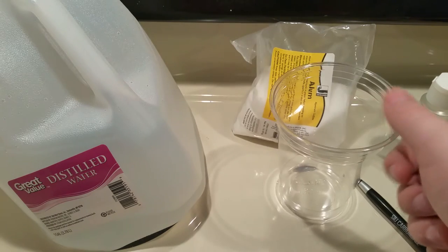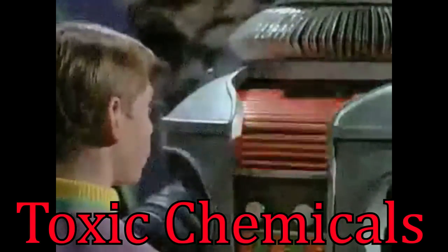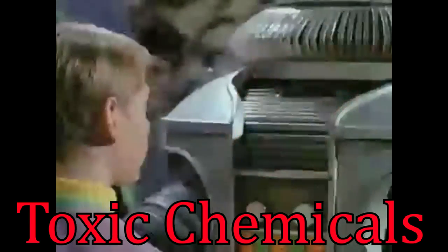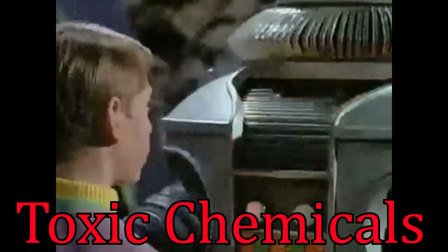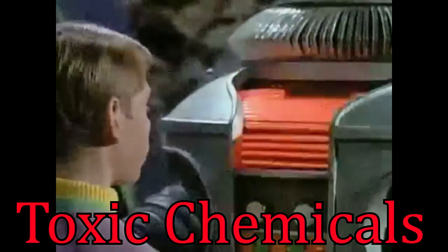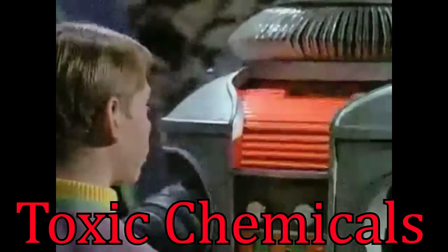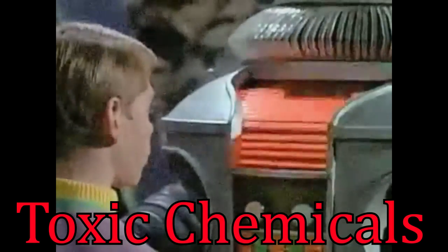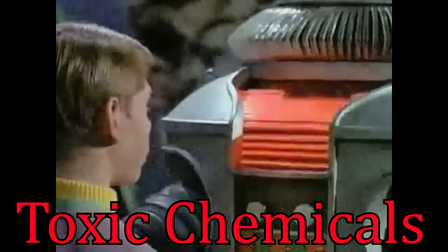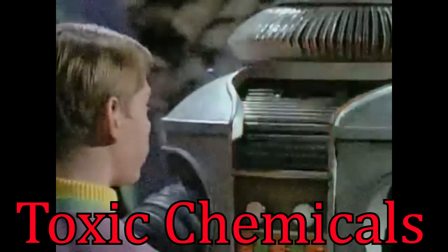Before we get started with the experiment, I need to talk a little bit about the safety of using these chemicals. Danger! This experiment contains compounds that are mildly toxic. Do not perform it without proper safety procedures in place. This means ensuring that you understand all the risks involved and have properly looked up the MSDS, or material safety data sheets, of all chemicals that you use in this procedure.